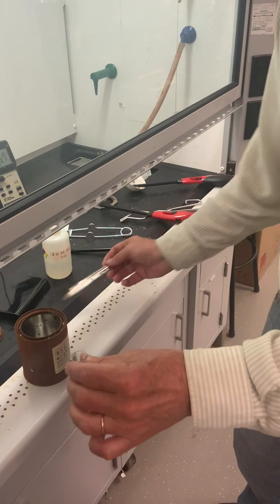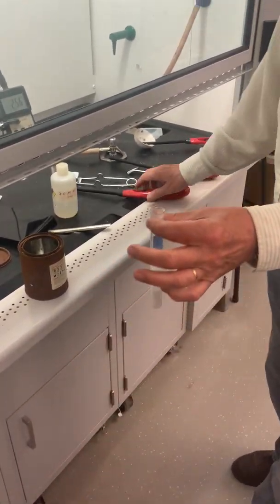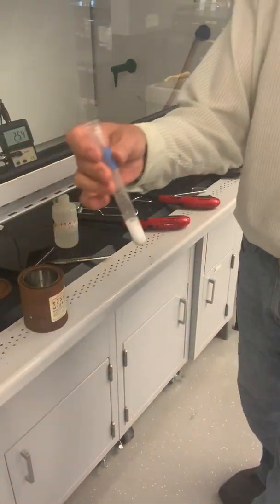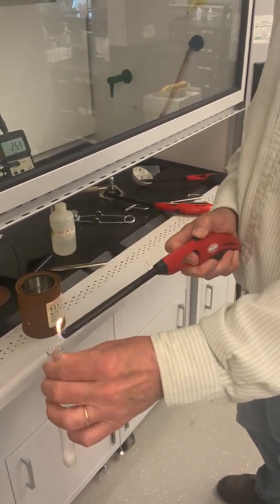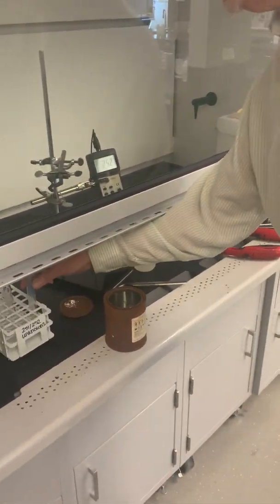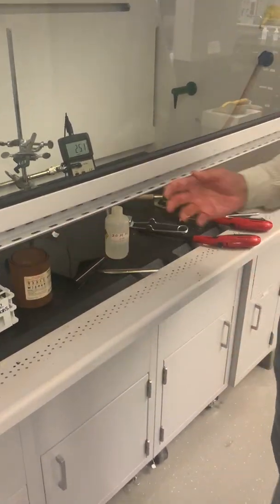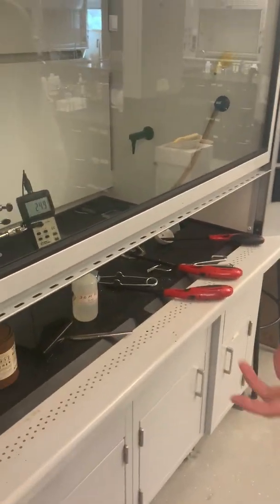In goes the magnesium. Ooh, nice one. Probably didn't hear that, but Jen added the important sound effects. There was that pop that you heard, and you actually saw a tiny little fireball form at the top of that test tube when we added that heat to the reaction products of the other reaction. And so there we have it, the sort of 6 reactions.